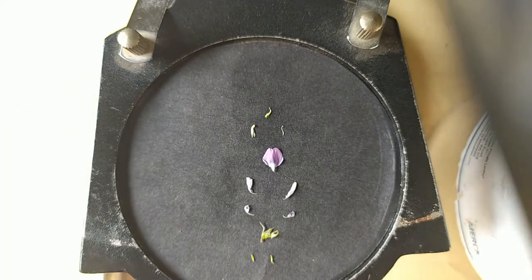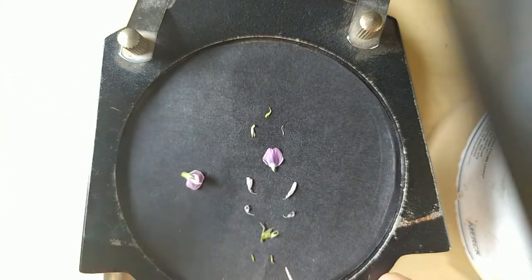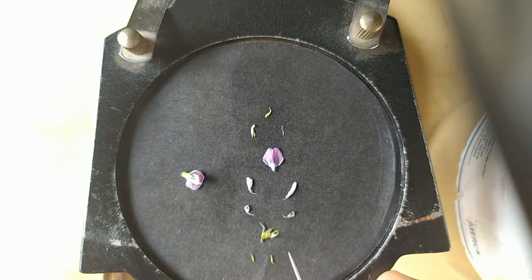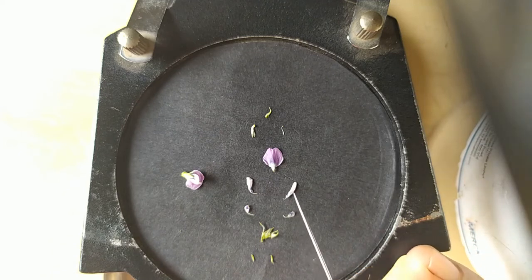Good morning, students. Today we are going to start dissection of soybean flower. The color of the flower is purple, and the calyx is fused together. So the condition of calyx is called a gamosepalous condition. On the calyx there is a presence of 2 bracts, and the 5 petals are present together.